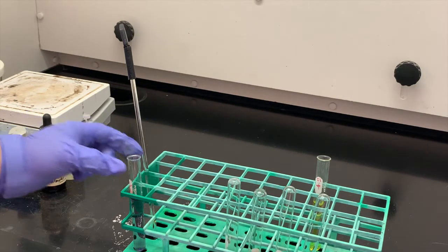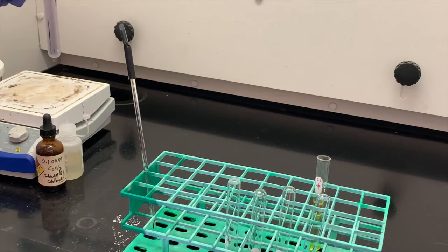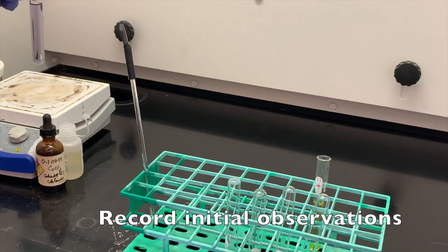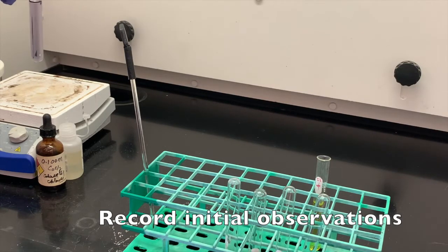So the next one for table one is we're going to add water to this. So this should be your initial observation of what it looks like. And then we're going to add water dropwise until we see a color change.